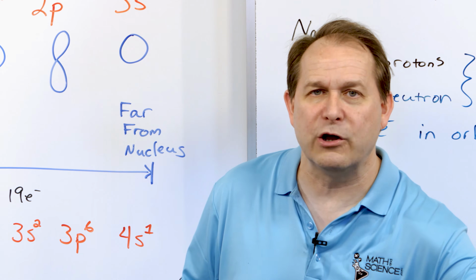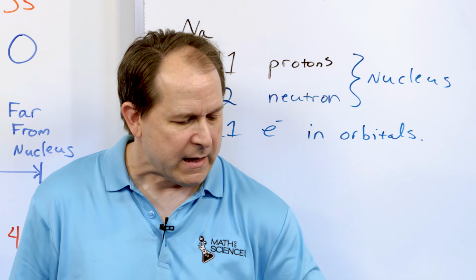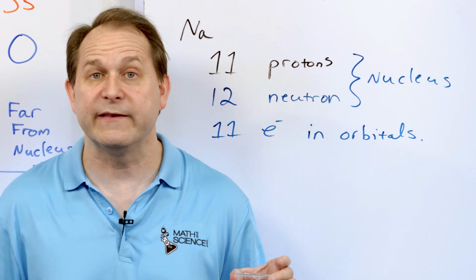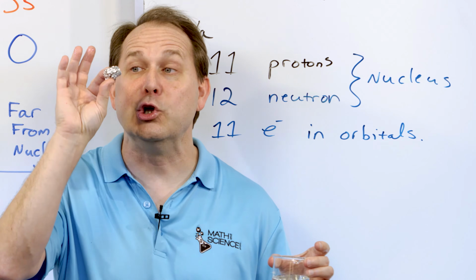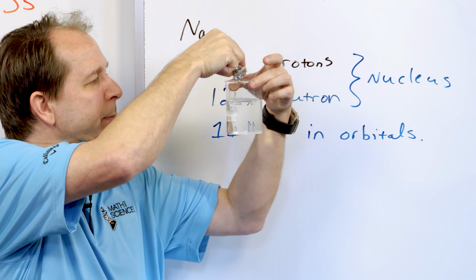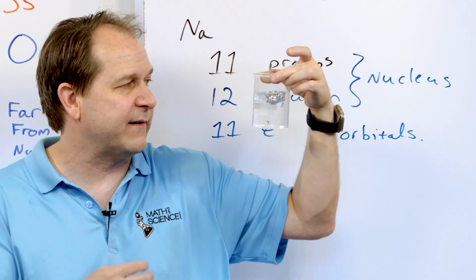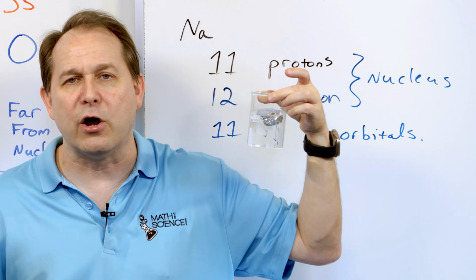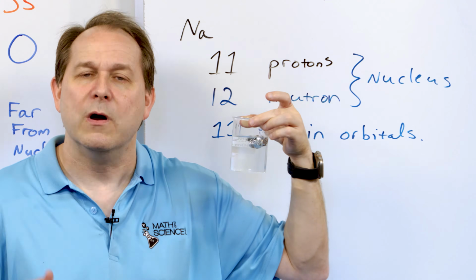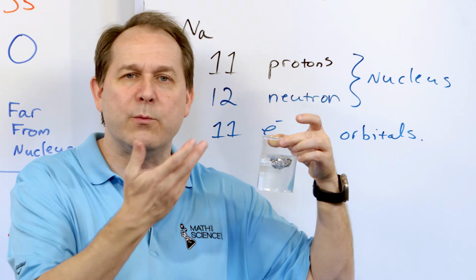Now, as you look at the slow motion video, I want to call your attention to this beaker of ordinary water. I want you to have this concept in your mind as we look at the video. This is aluminum foil. It's aluminum metal. If I take this liquid water and drop the aluminum foil in, absolutely nothing happens. Of course, the aluminum floats on the surface because I've got it in the proper shape for the buoyancy, but no chemical reaction is happening. Aluminum is a metal. Copper, if I put it in there, nothing will happen. Nickel, iron, I put it in water, nothing happens.